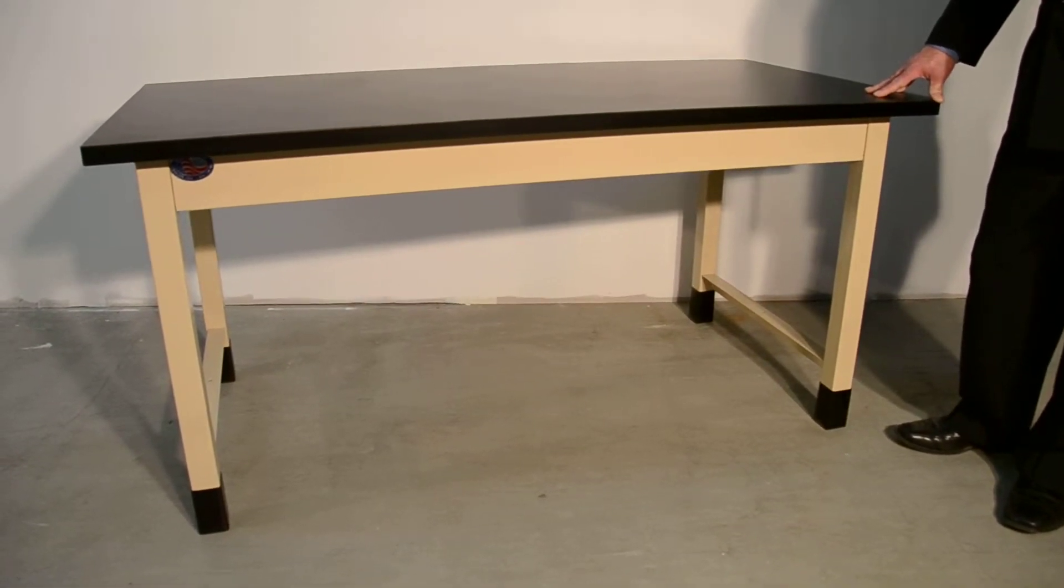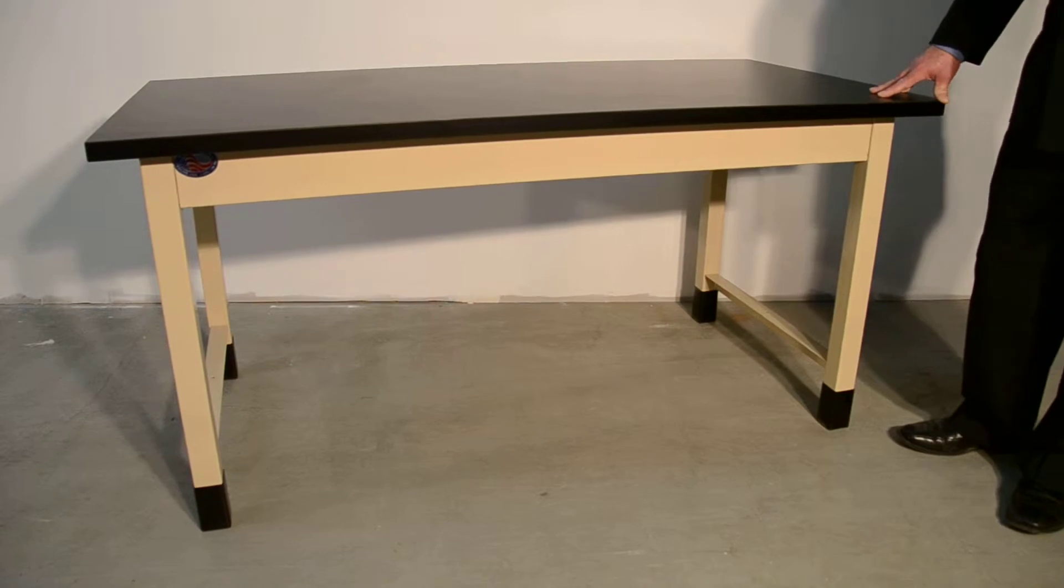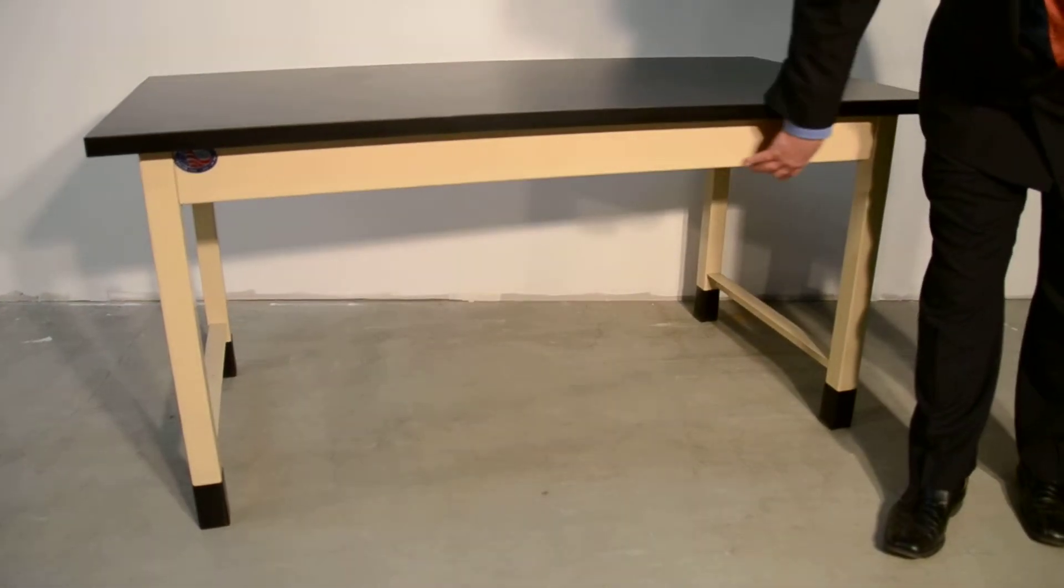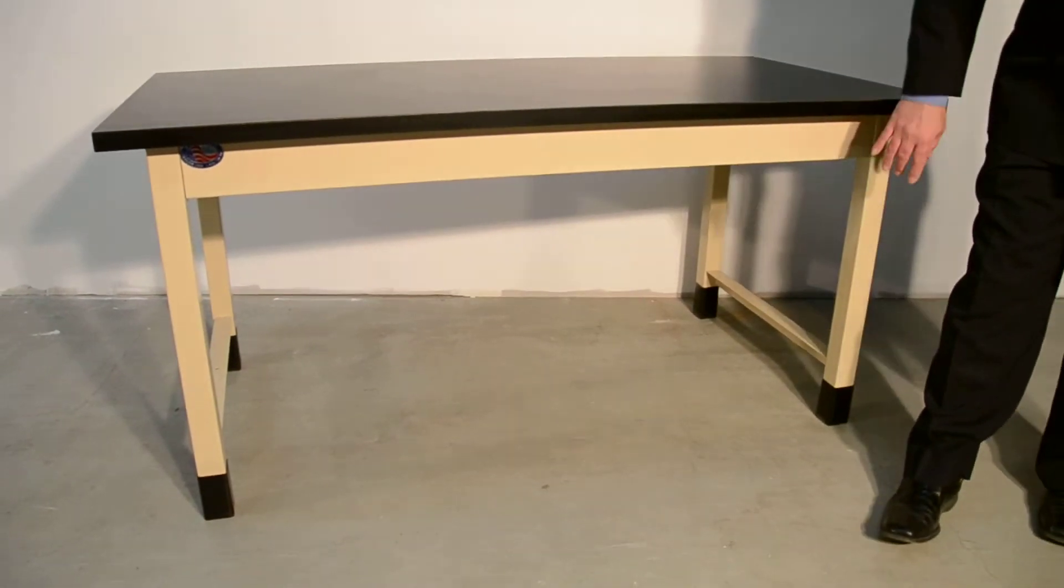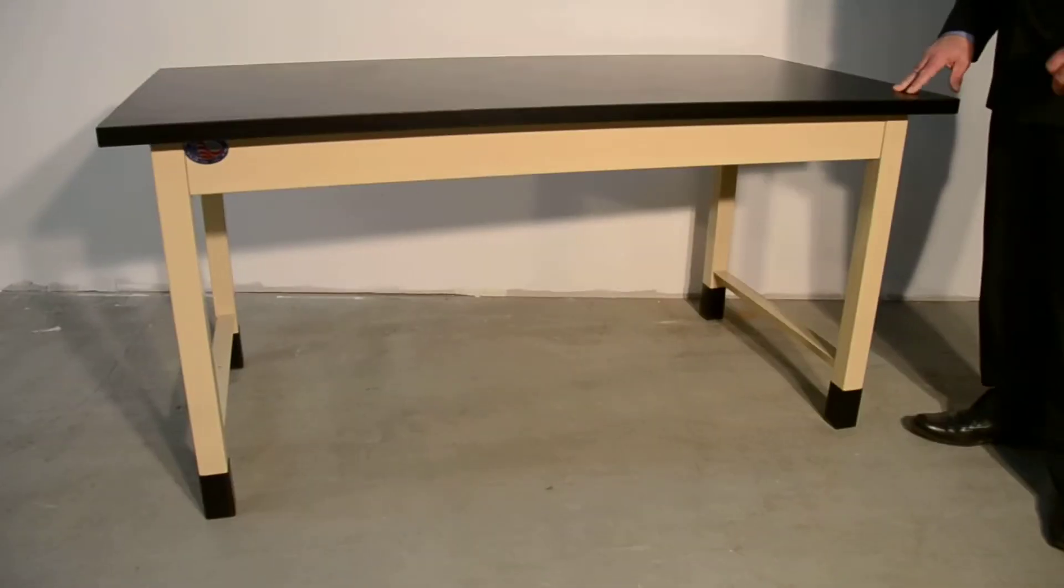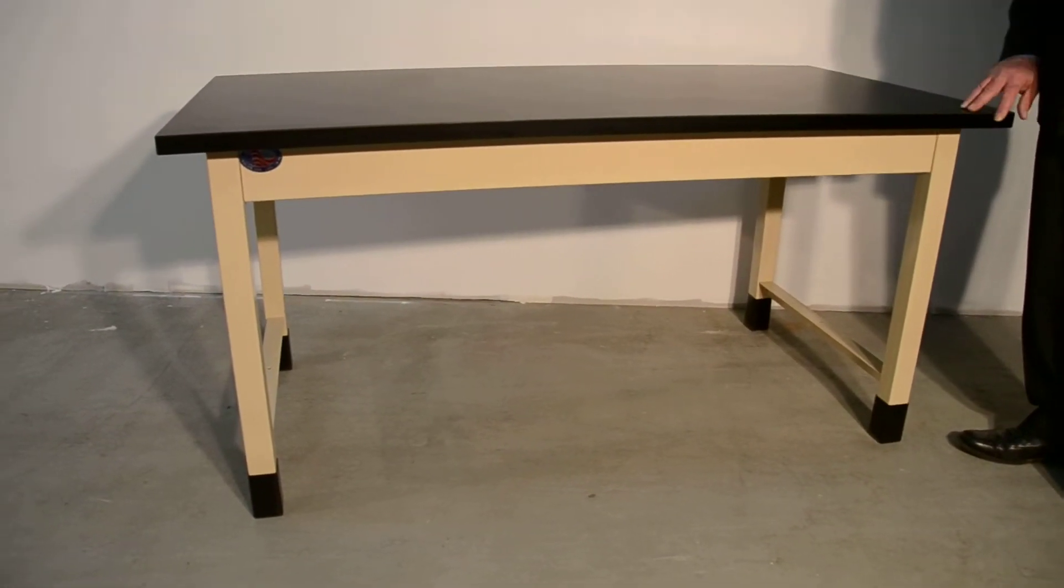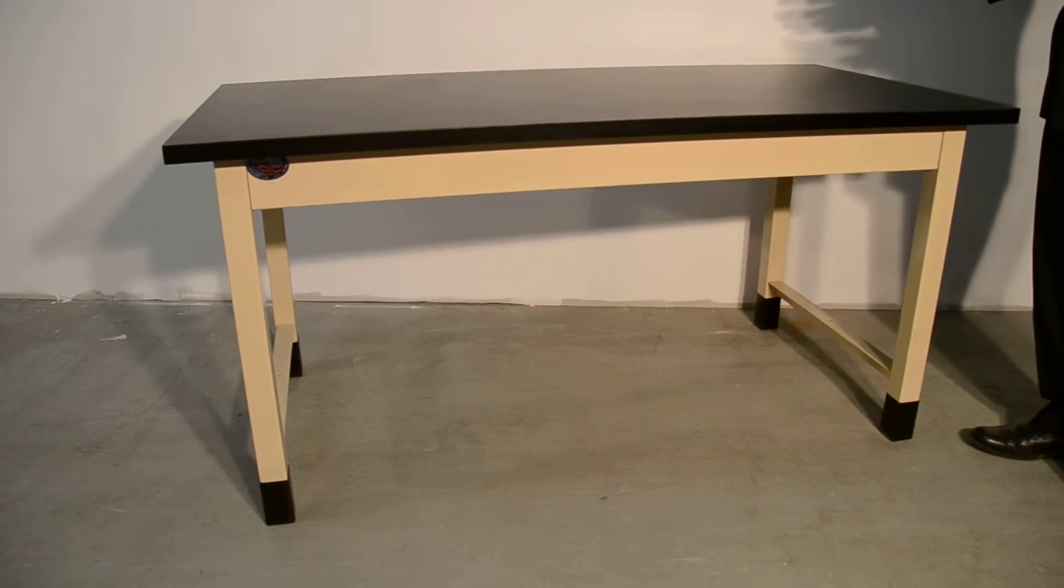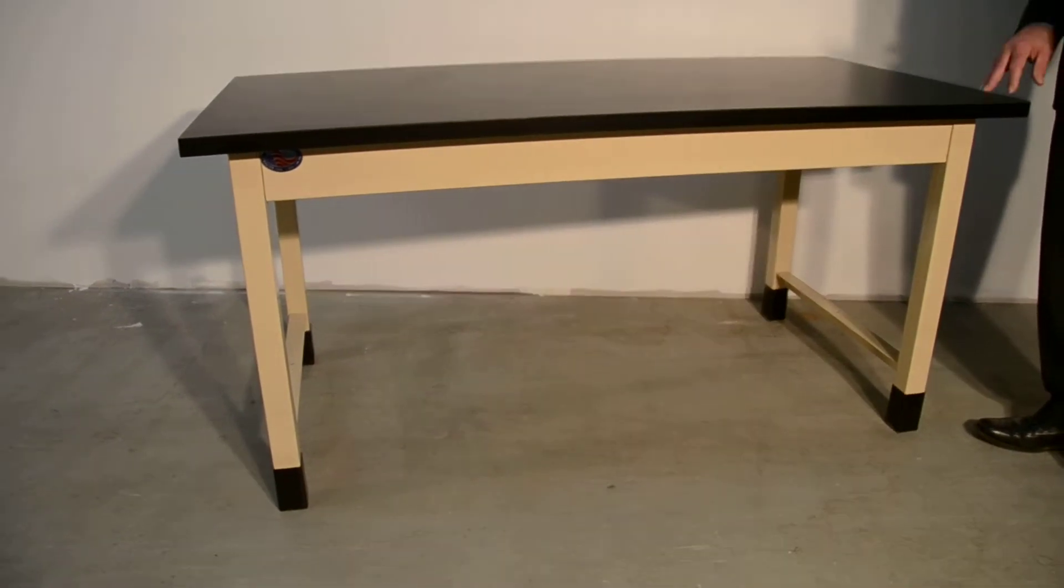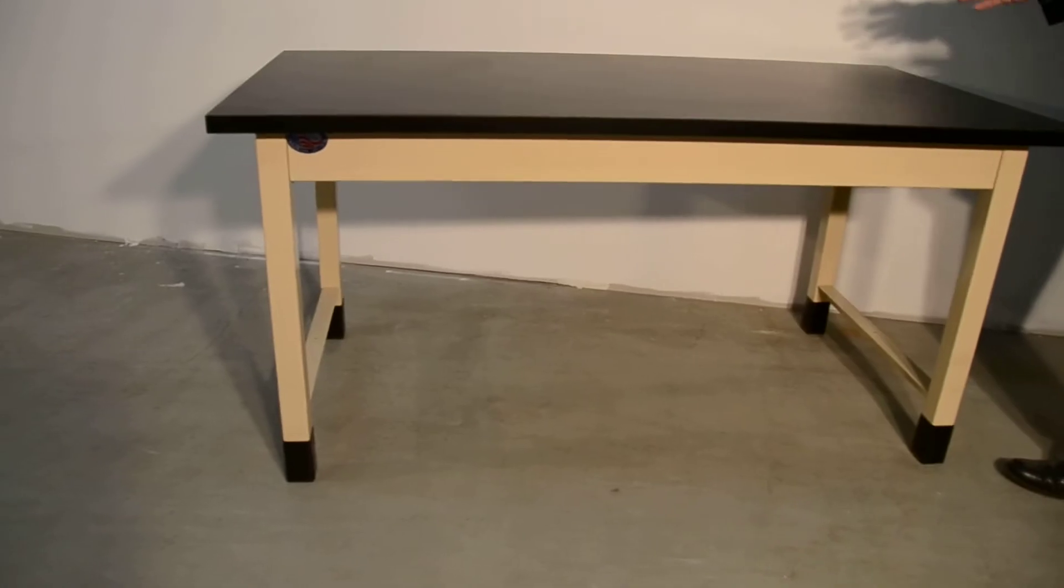Some of the nice features on this workbench that make it ideal for laboratories is it has a 4-inch apron all the way around on all four sides. What this allows you to do is either sit in the front or the back of this workbench. So if you want to put it into a classroom setting, or if you want to put equipment on it that you need to access from both sides, you can easily do that.